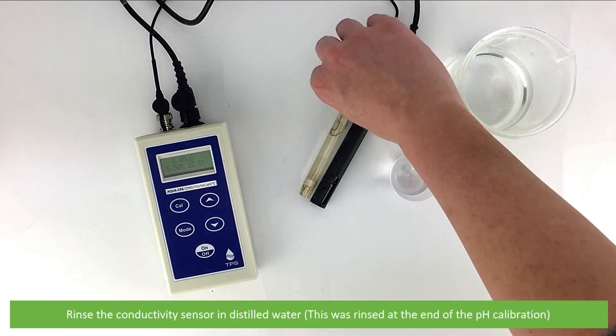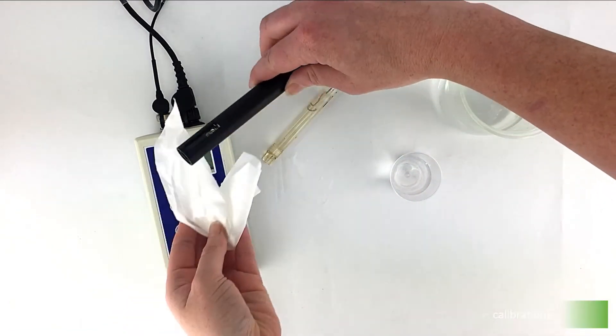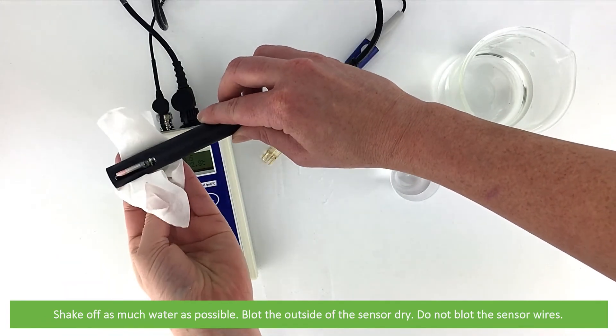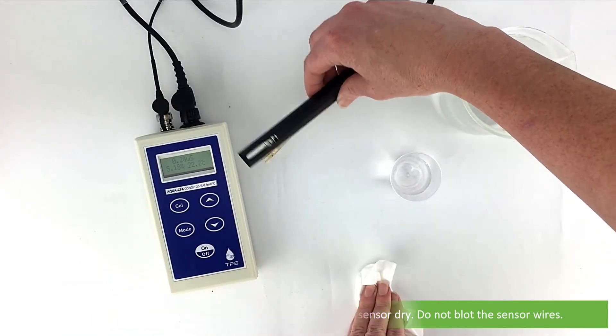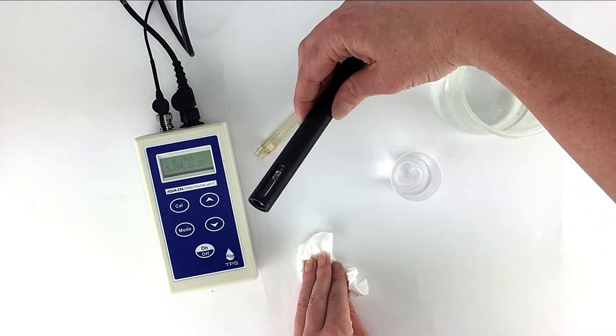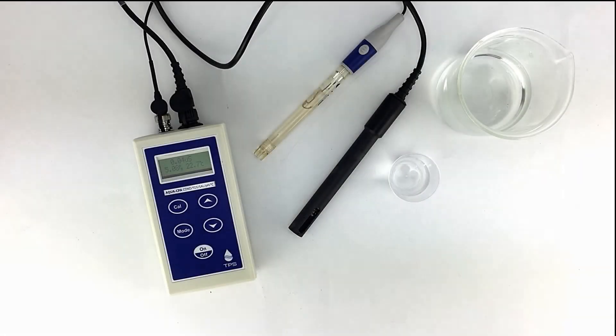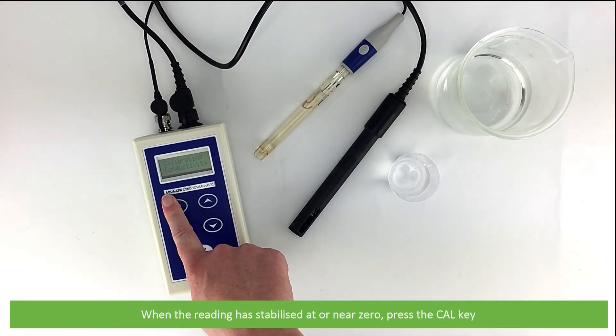Rinse the conductivity sensor in distilled water. Shake off as much water as possible and blot the outside of the sensor dry. Do not touch the sensor wires. After rinsing the sensor, leave it to air dry.